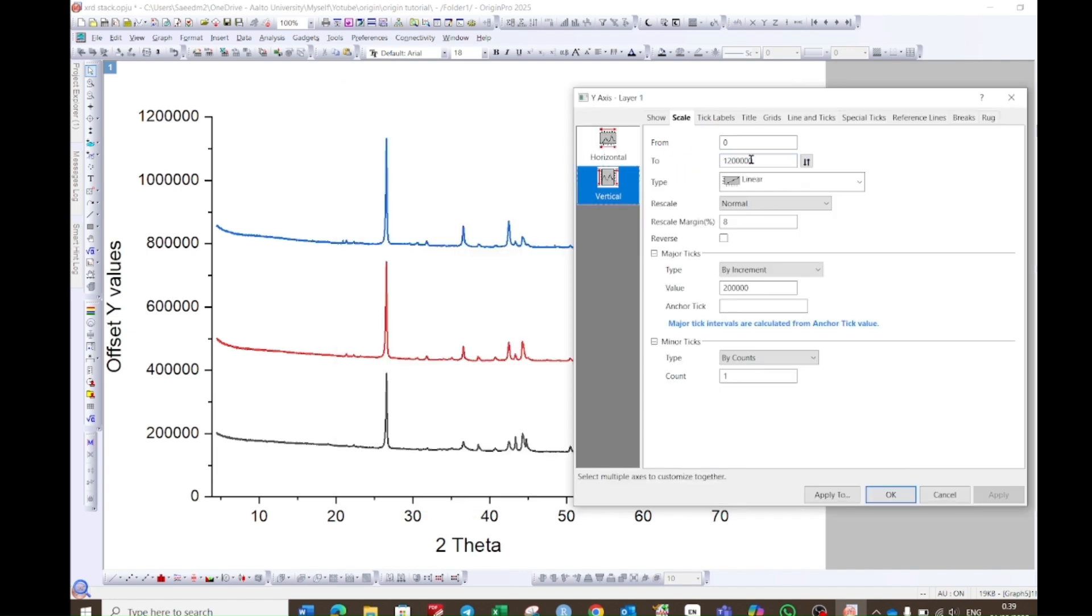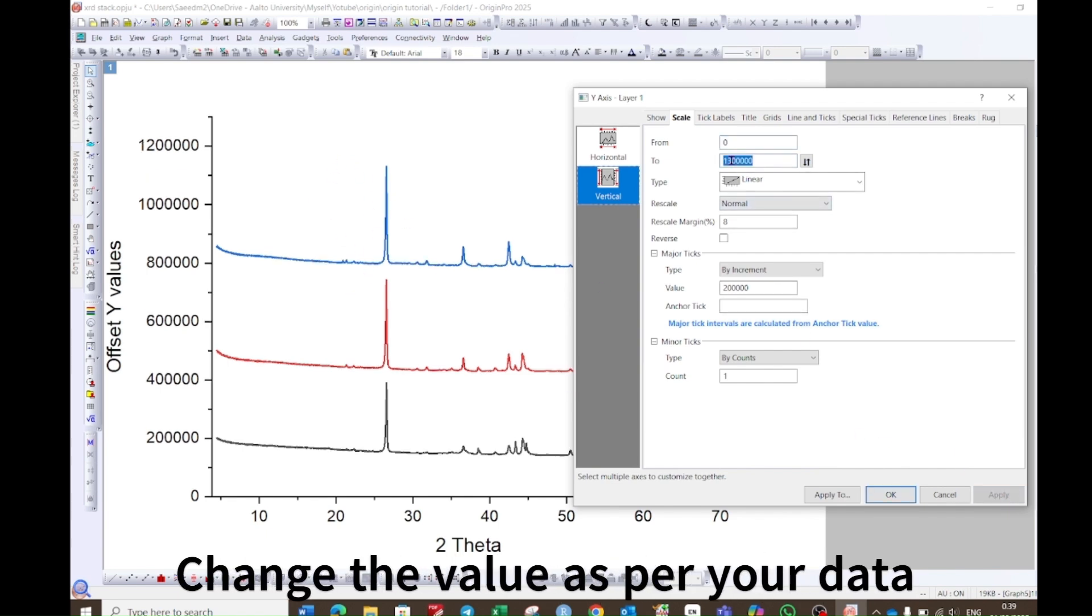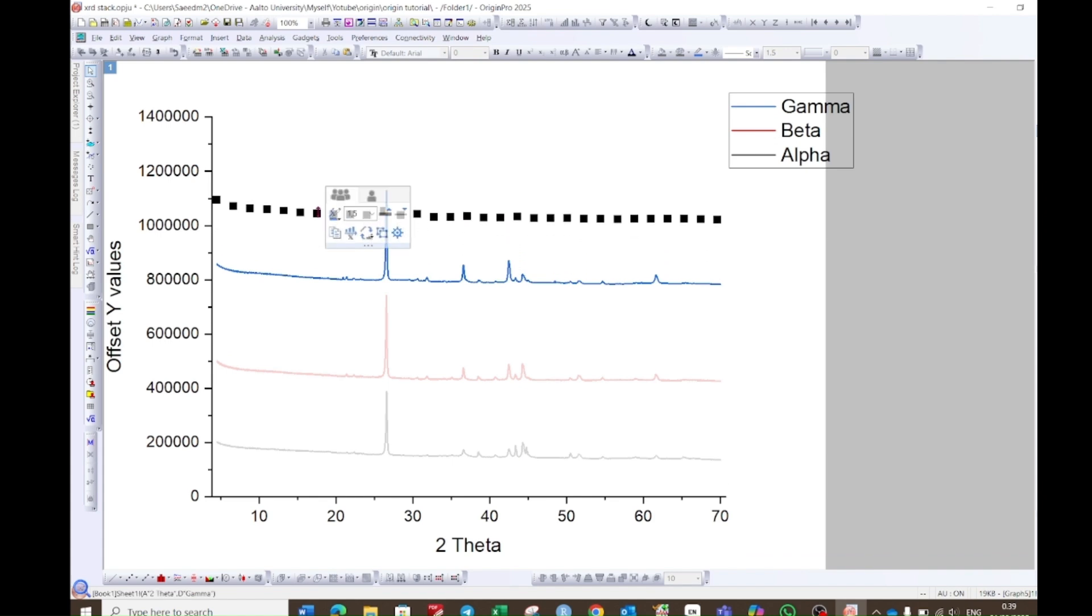Change the values from zero to some values which will be according to your data. If I increase it and then apply, then you will see the distance will be generated. At the moment I will increase it to a certain distance, and then you can select this and then drag it up.